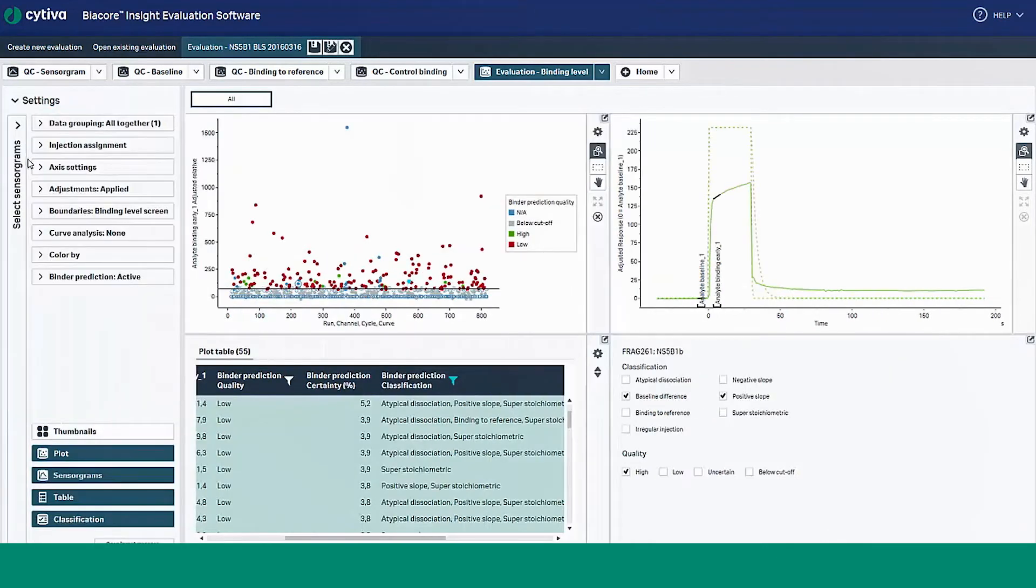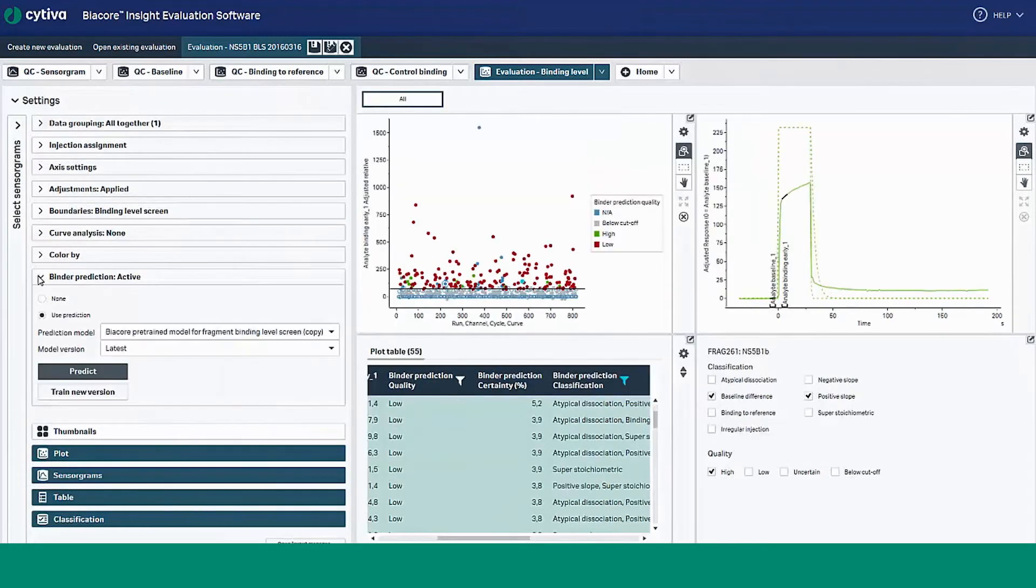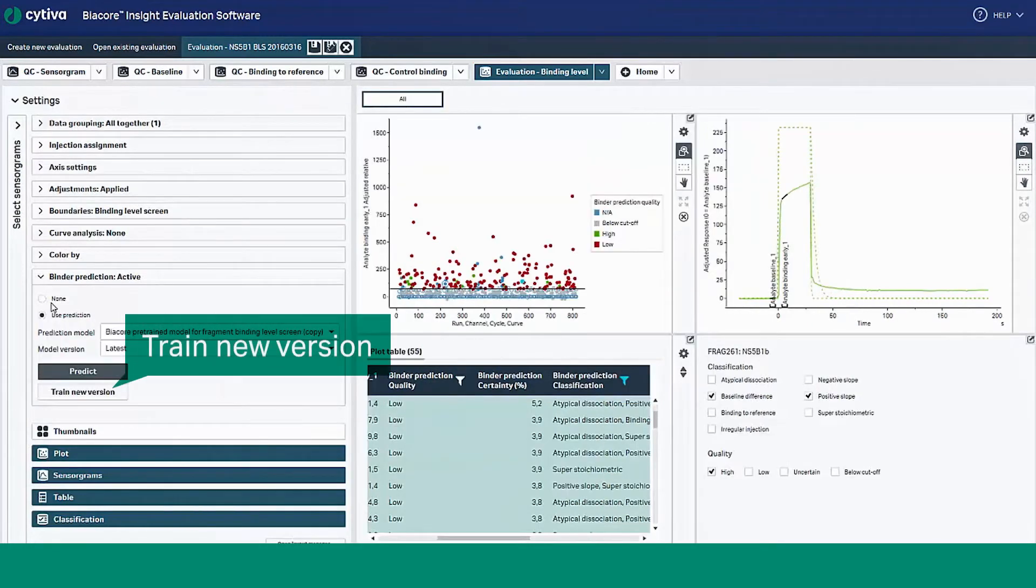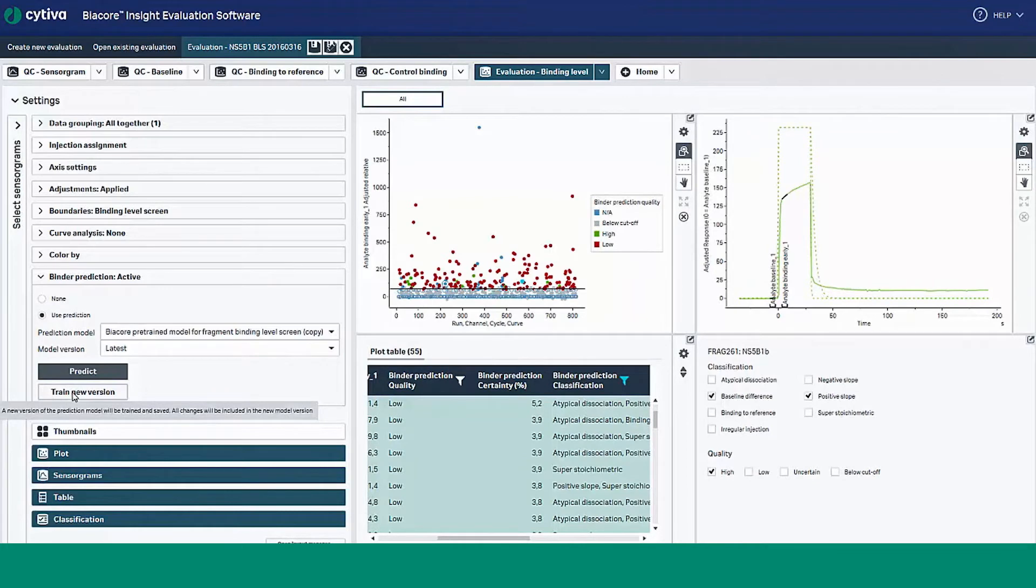You can make changes to the prediction by selecting train new version. Make a mistake? No problem. You can easily revert to prime models without overwriting any of the models you've previously created.